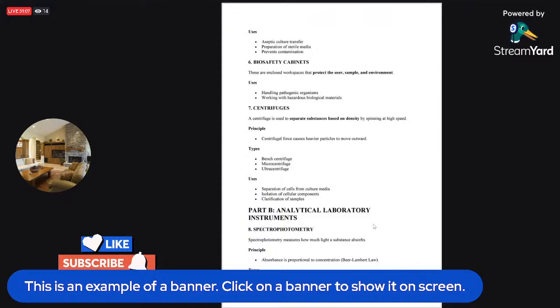For example, if you are dealing with an organism like Mycobacterium tuberculosis, that is at BSL 3, very high, because they are in fact very virulent. They are virulent, so you can't just joke with that. You need to be extra and extra careful. So it's not just anyhow. When you go to a TB lab, they don't allow just anybody anyhow.